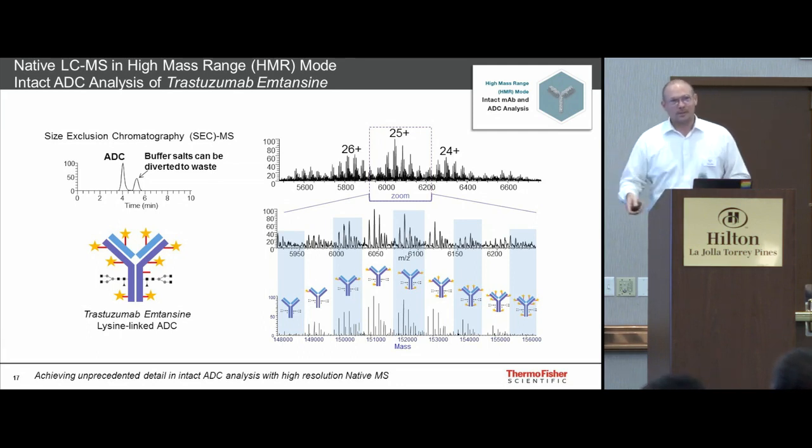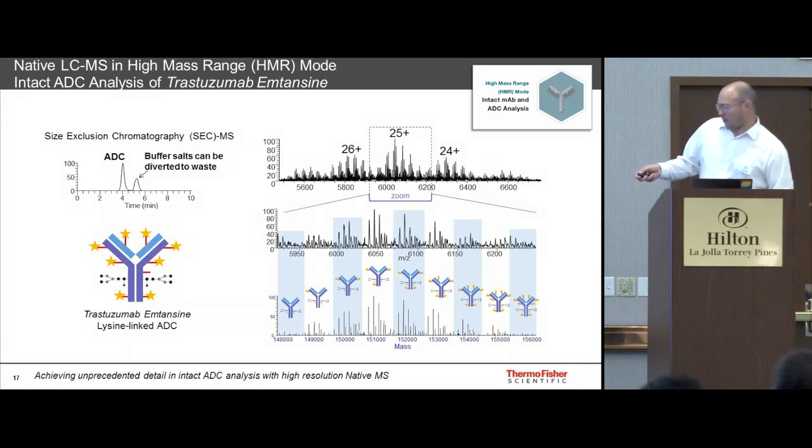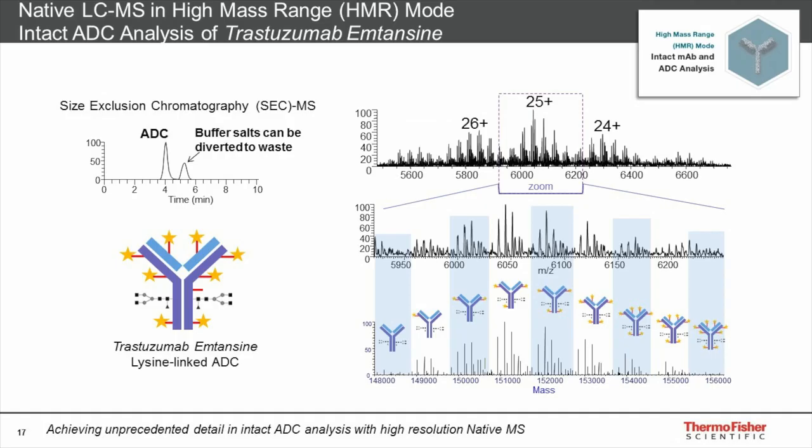Not just that this is where my protein should be, while we forget about the other peaks. In this case, if we zoom in on the deconvolution result, so this is mass, and we're looking at the D4 cluster, we're going to have information here from the glycoforms and from the different amounts of drug. And as we see, these are not just random small peaks. We can depict the free linkers here as well. As you go through and label, and I wasn't extremely comprehensive, there are actually additional peaks here that we could label.